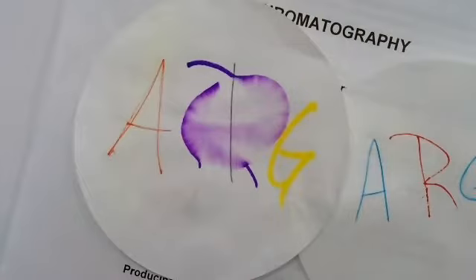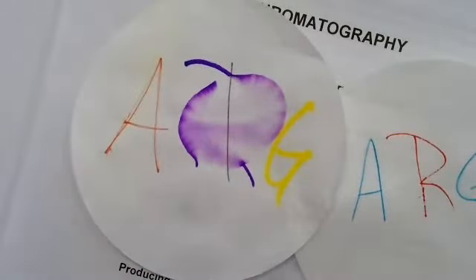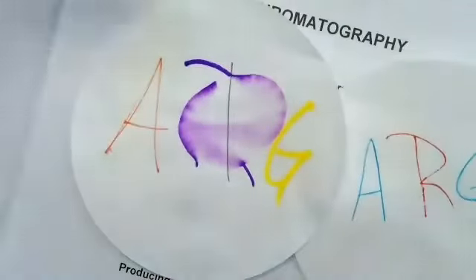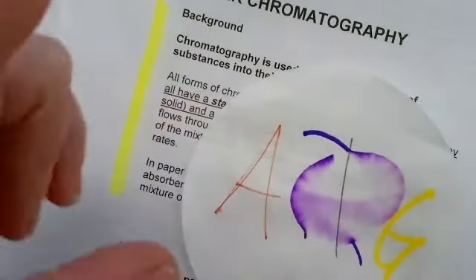Was the stationary the paper and then the mobile? Gosh, jackpot. Yes! My morning class kept saying, oh, the markers were the mobile. No. The marker is what we're trying to investigate. That's our test substance. So here, the purple bled.